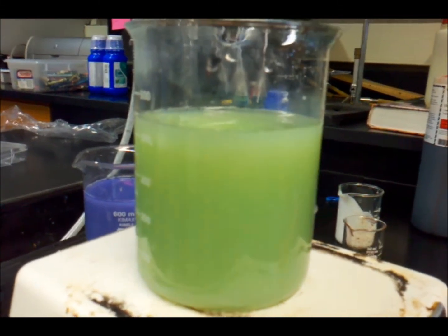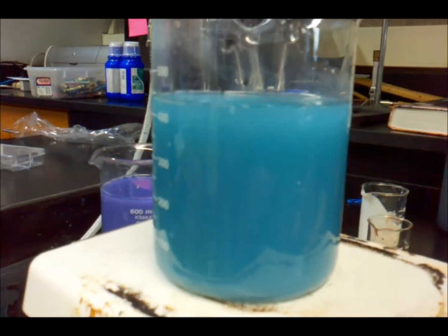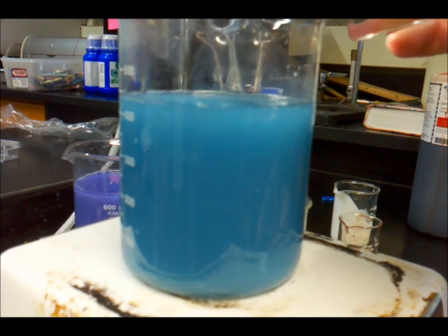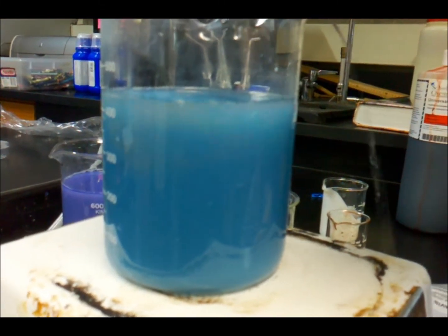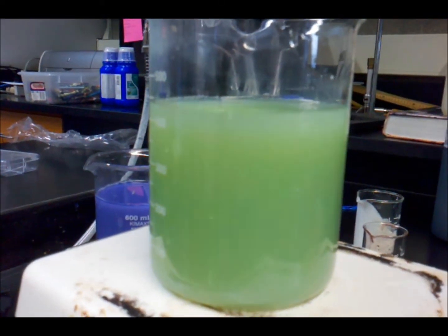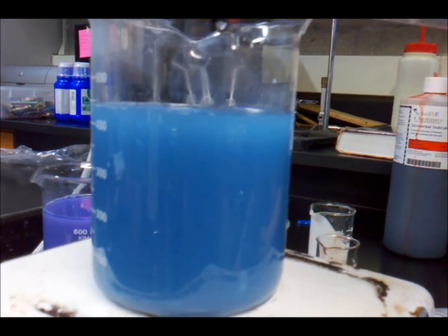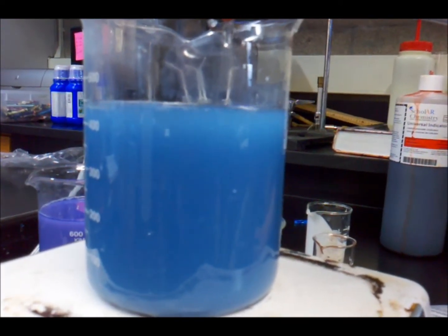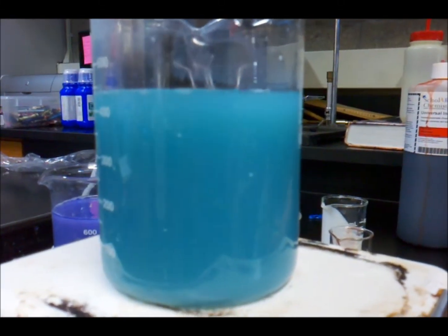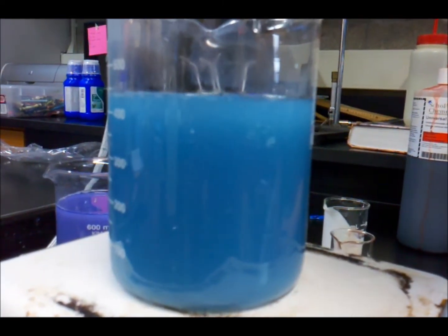Now it's just a tiny bit. Oh, now it goes back. We're going to go back now. Yeah. Oh, nice. We're going to go back to blue on there.